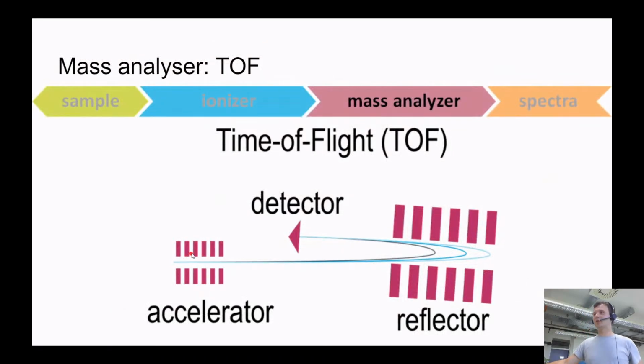Okay, so now we're coming to the mass analyzer, and there are different ways of doing this. But I also have to say the mass analyzer is a very mature, very old field. Even the electron was discovered with a very old mass analyzer by Thomson. But for modern mass analyzers used in life science, for analyzing proteins, there are more or less two solutions commonly used in the field. The first is time of flight, very frequently called TOF. And another one is Orbitrap.